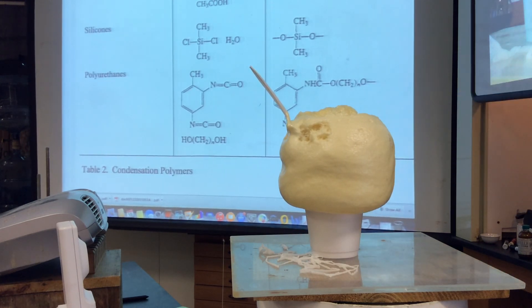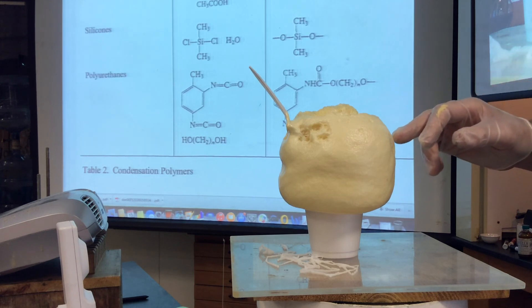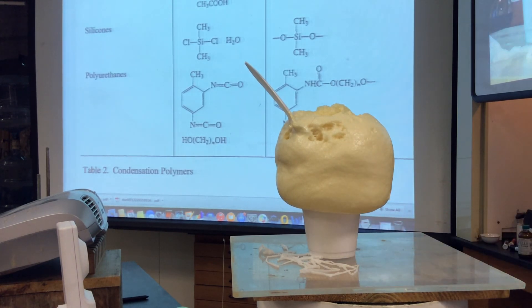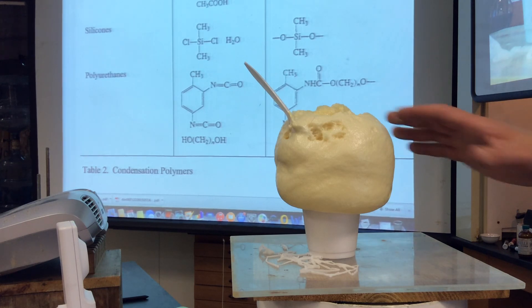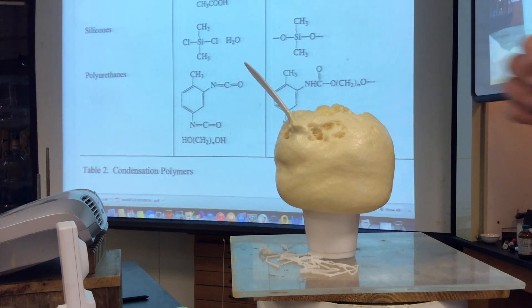Maybe it's some kind of cotton candy gone bad or something. I don't know. Oh yeah, that's the foam. We have time, we'll make another one. So yeah, that's the polymer. Could you like touch that or not? Yeah, once it dries, it's getting there. So those are the two reactions of condensation polymerization. And I hope you get the idea that monomers are being put together. And in about two seconds, what I'm going to do is touch it and throw it around. Is it hard? It will be, yeah. It's just going to dry. Is it kind of like spongy if you break it open? Because that's how it can actually. It's going to be hard. It'll be a hard, you know, crusty kind of insulation. Can you try it with your finger? In touch with your finger, is that like, how it can react to it? Yes, you can. As long as it's dry. If it's still wet like it is here, you might. Yeah, it's still a little sticky. But it's getting, it's drying fast. And you're going to see how hard it is in a sec. Give it another minute or so.